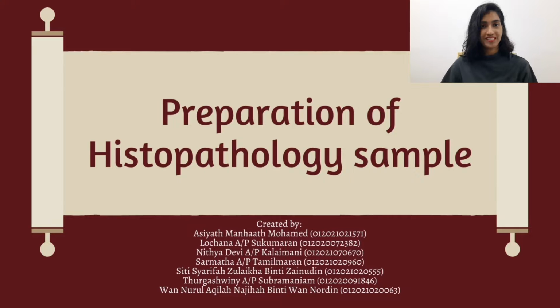Histopathology is the microscopic study of diseased tissue through microscopic inspection of a biopsy or surgical specimen. Histology technique is the set of procedures for the preparation of tissue material for microscopic examination. It goes through several processes which we would like to elaborate more on.